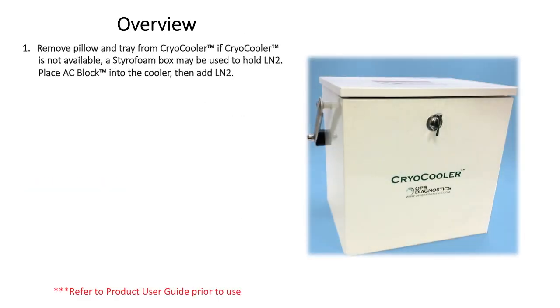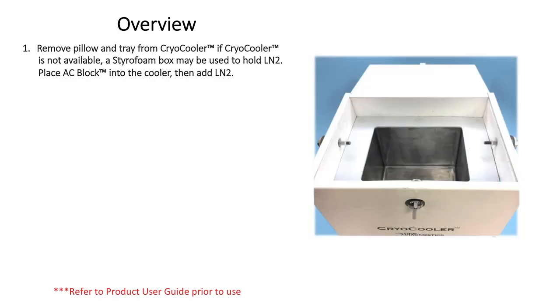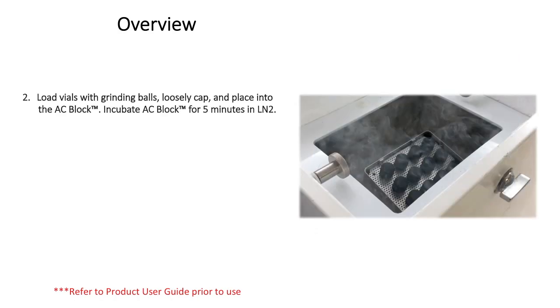Remove the tray and pillow from the cryo cooler. If a cryo cooler is not available, a styrofoam cooler can be used. Place the AC block in the bottom of the cryo cooler. Add liquid nitrogen to the cryo cooler so the level is even to the grate of the AC block.